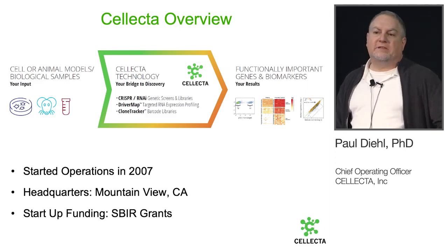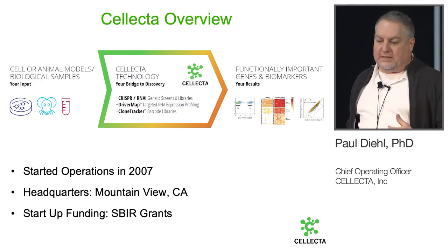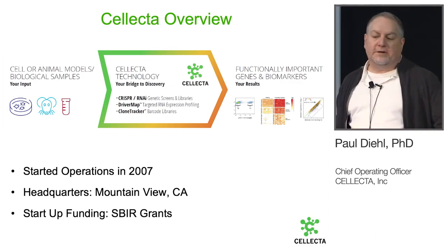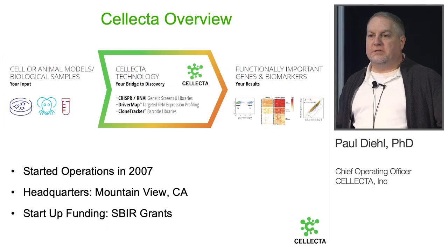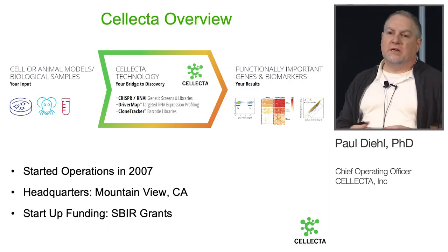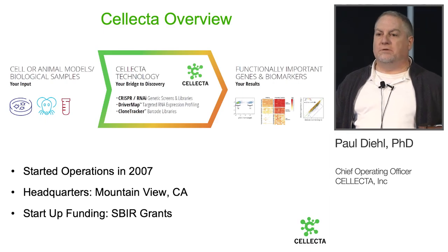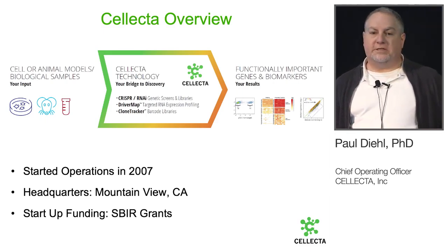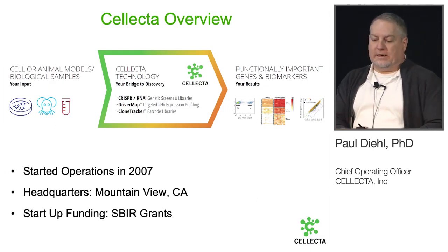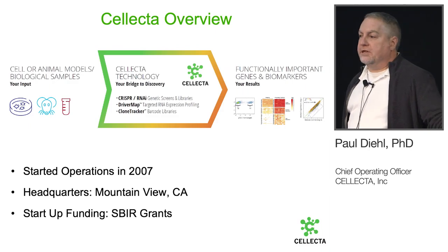to give us a little bit of time to tell you a little bit about Cellecta technology and then about an interesting application that Dr. Ian Winters is going to talk about in using barcoding technology, which I think really will demonstrate how some of these approaches can be used now that we have the availability of next generation sequencing, the ability to make high quality libraries with oligonucleotides, and how that sort of technology can be applied.